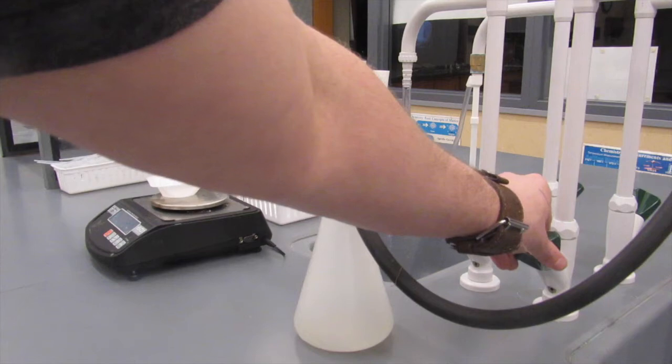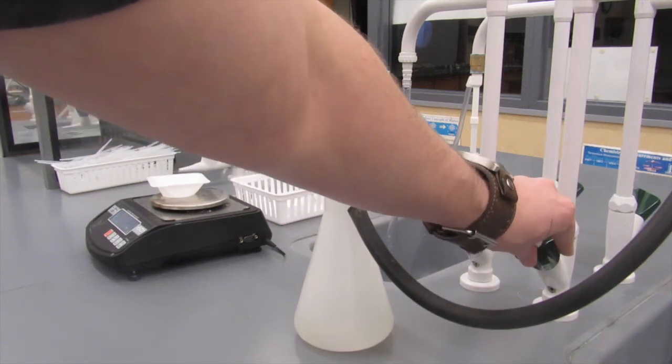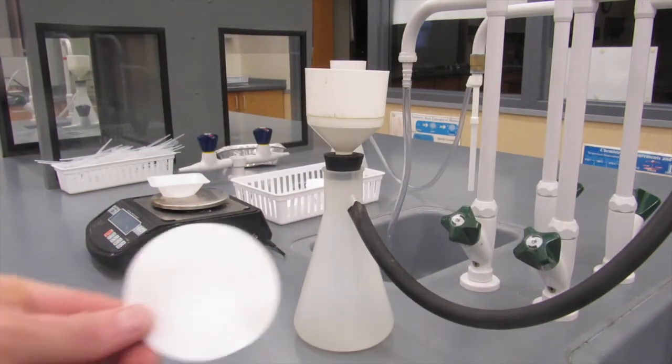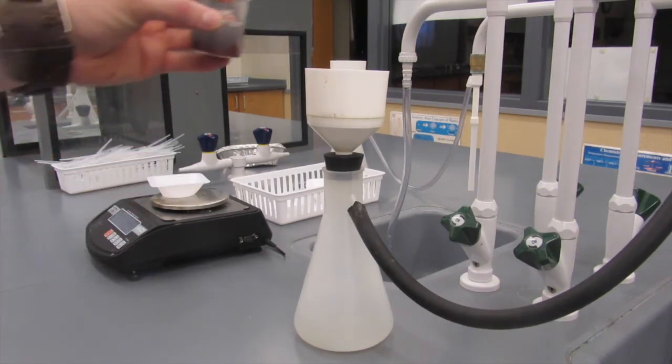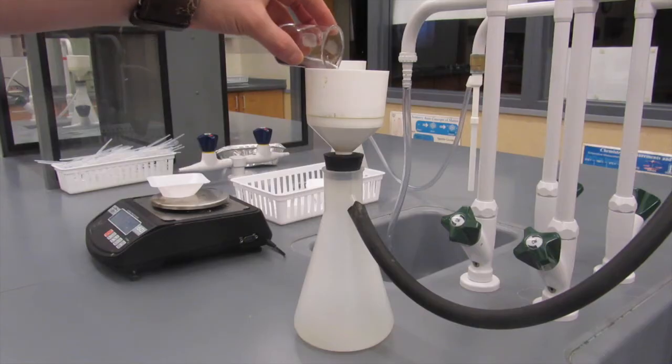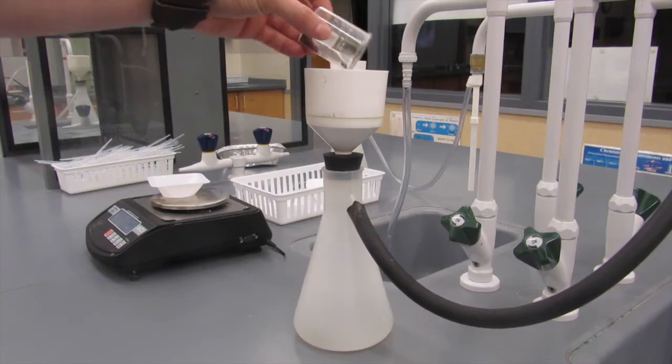A vacuum filtration is used to separate the copper out from the rest of the solution. When you turn the water on, the aspirator creates a vacuum inside of our vacuum flask, and a filter paper is placed on the inside. It's usually a good idea to weigh the filter paper before doing the filtration.